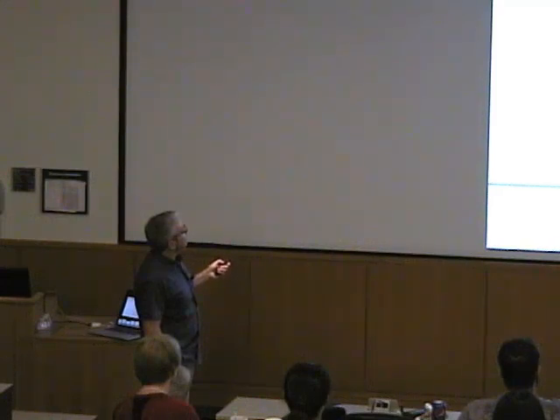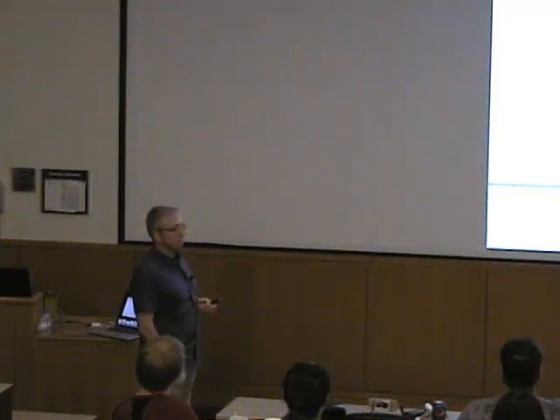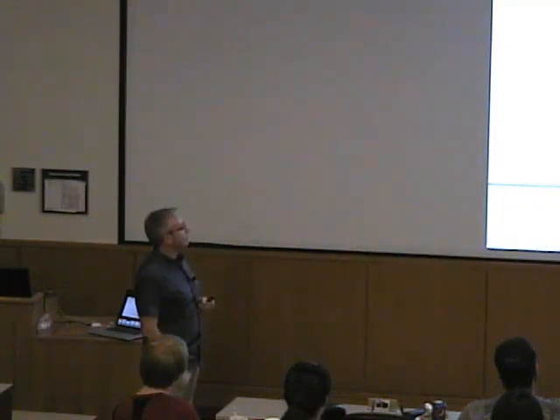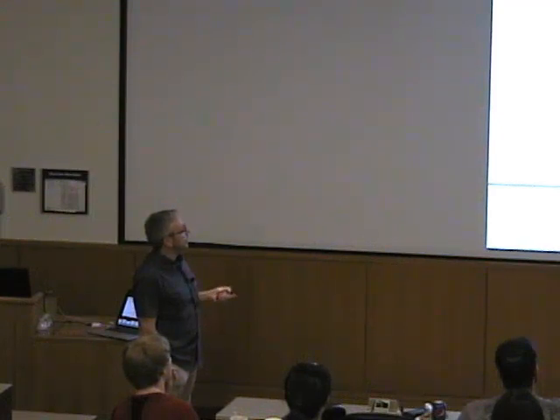Then we have FH, and for that we know amplitude and phase, which means we can actually draw a vector. And then we have FPH, and again, we do not know the phase angle, but we know the amplitude. So we have this sum, which means that basically we might as well draw this vector up here.